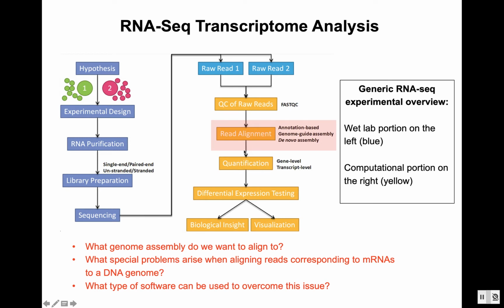This short video is going to talk about how to do the next step in an RNA-seq pipeline, which is the read alignment step. That's where you take all of your sequencing reads, and then you align those to a reference genome.